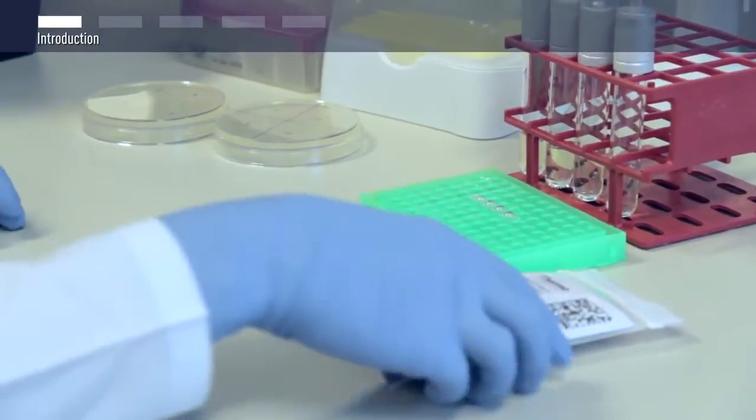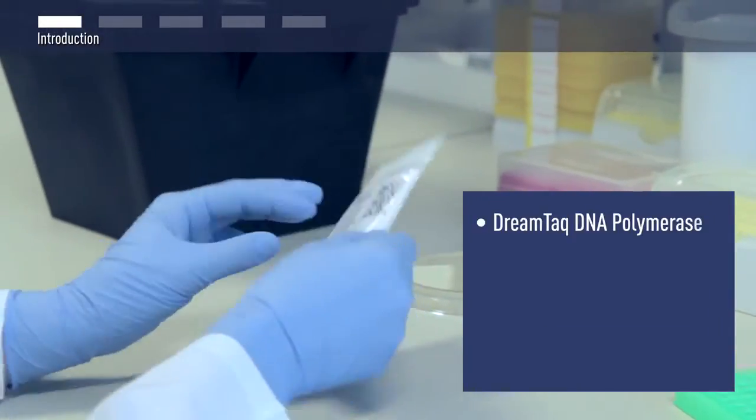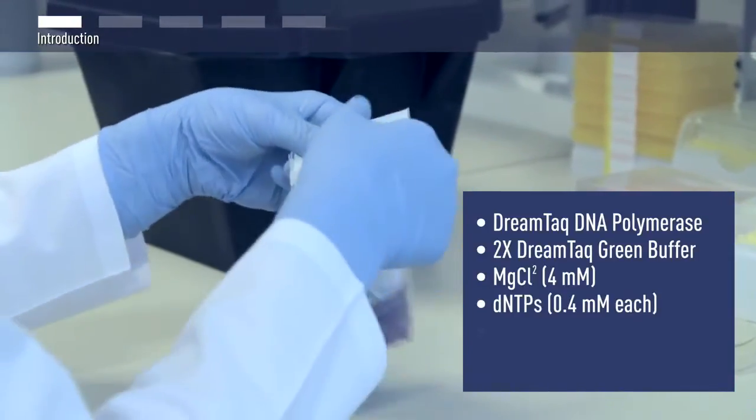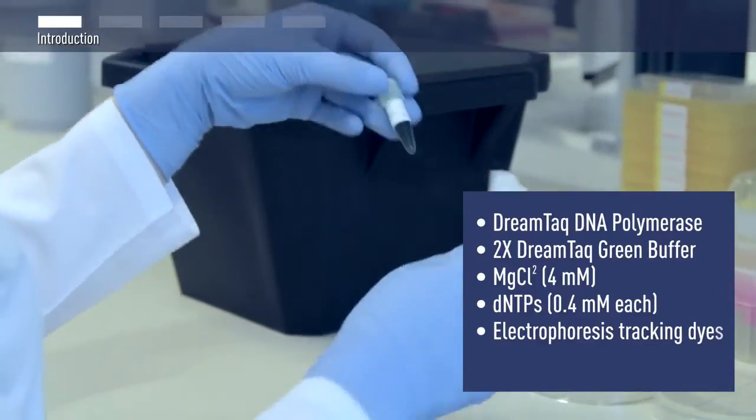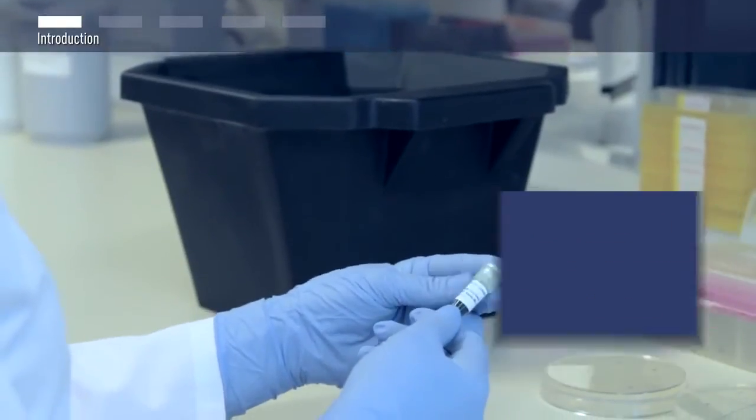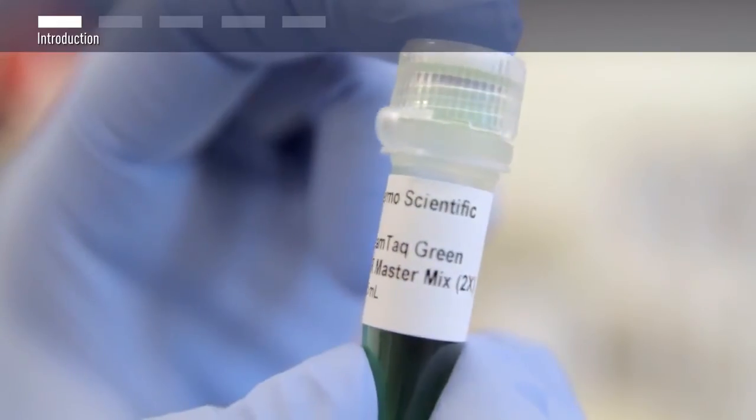DreamTaq Green PCR Master Mix contains everything you need to perform PCR, except for gene-specific primers and template DNA. The Master Mix is green because it includes two electrophoresis tracking dyes and a density reagent. This enables direct loading of PCR products on gels after PCR amplification.